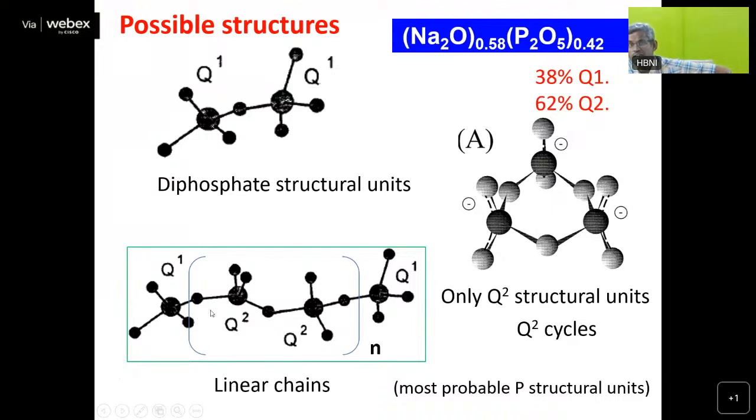In addition to that, there is a bond order increase in Q2 because they are coming more and more closer to the ionic side. So the chemical shift slightly increases. So this can also be explained by this 2D NMR. It's a very minor thing, or maybe one of the additional pieces of information given by this double quantum NMR.